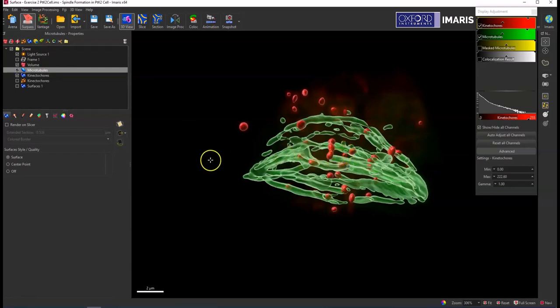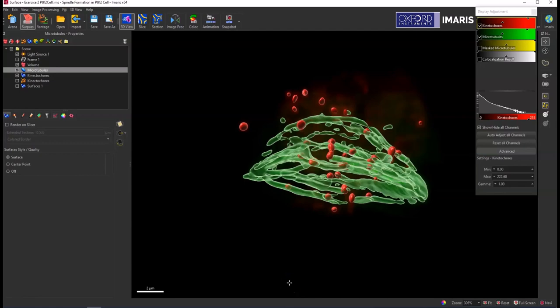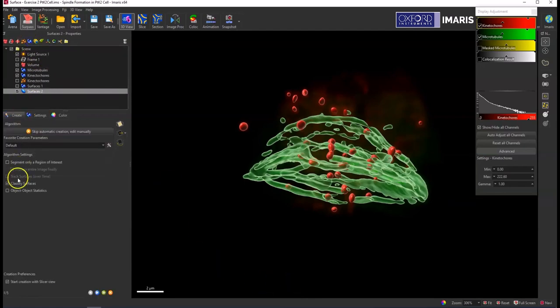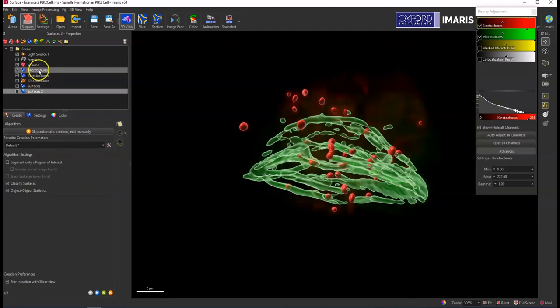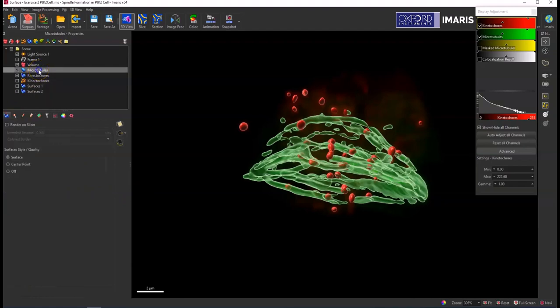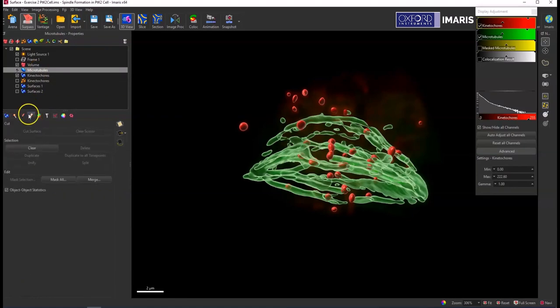The important thing to remember with both of these options is that you need to have object-object statistics enabled. So you can enable object-object statistics in the first step of the creation wizard just by checking this box, or after a surface or spots object has already been created you can enable this option in the edit tab, the little pencil icon, and make sure the box here is checked for object-object statistics.